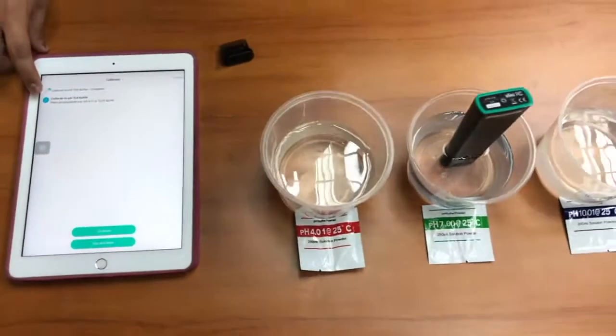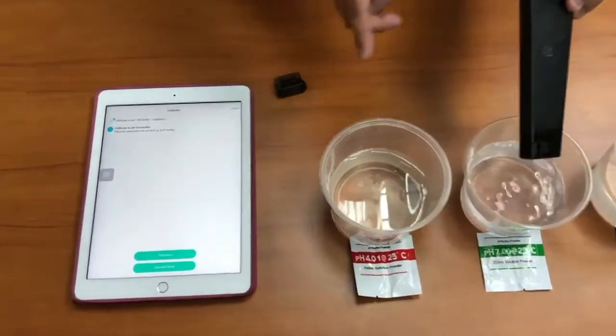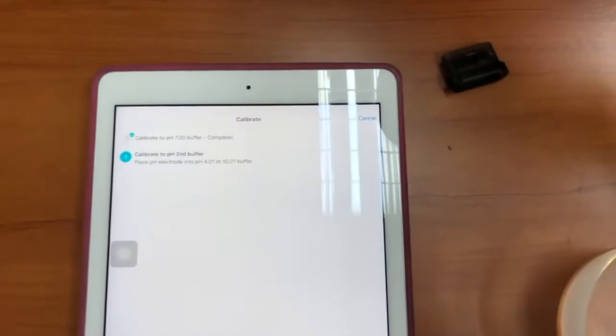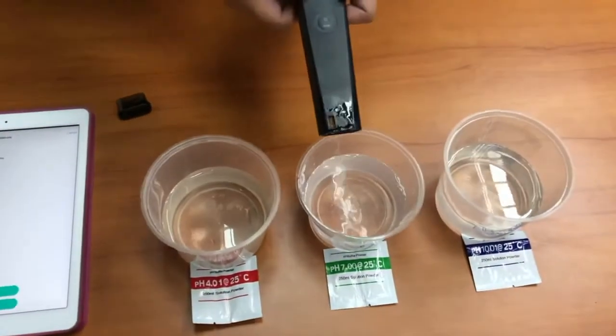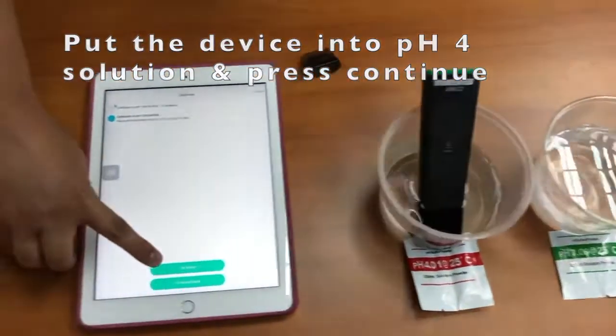Now we're going to go to the second step, which is to calibrate to the second pH buffer. We can choose either pH4 or pH10. Now I place this pH meter into pH4. Let's place it first and continue with calibration.